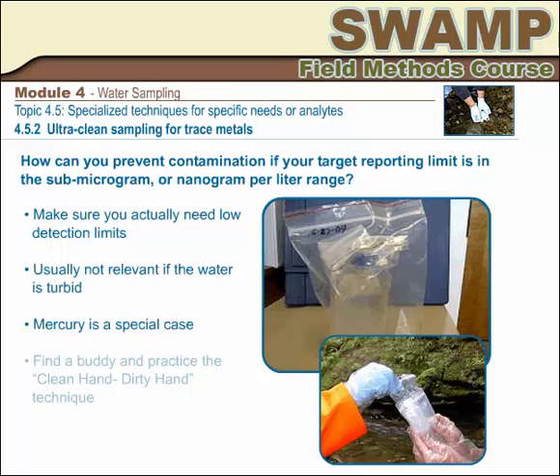Samples for mercury require even more careful handling, because the detection limits are extremely low. We need to know about these minute amounts of mercury in water because mercury accumulates in organisms and its tissue concentrations increase over time and as we go up the food chain. Because of the high sensitivity of the analytical methods, contamination may be easily detected and interfere with the results, so the sampling needs to be done with extra precautions against contamination.